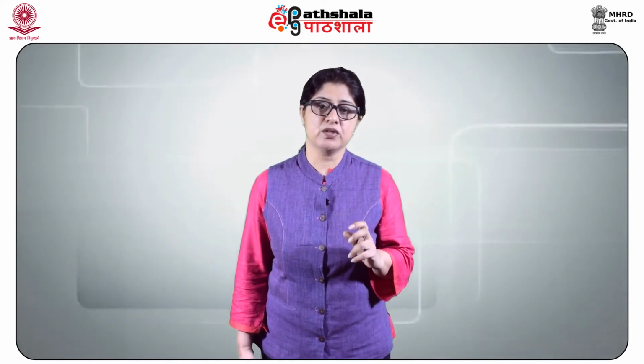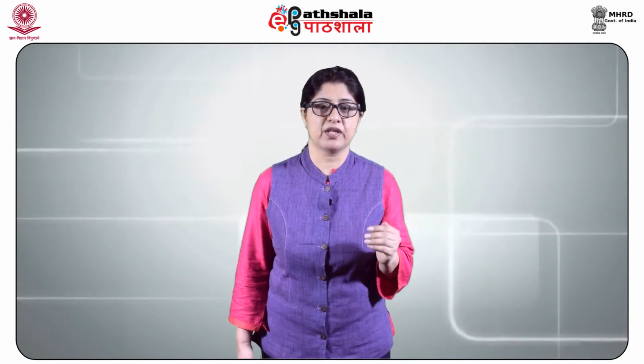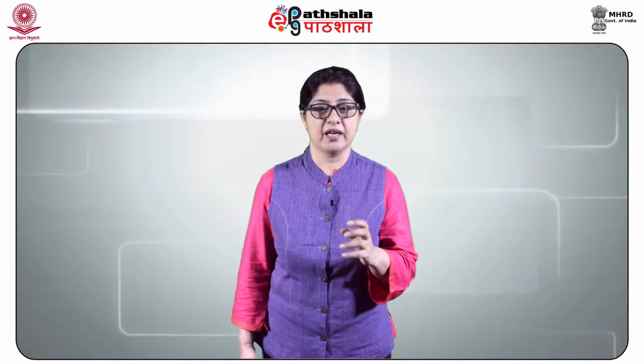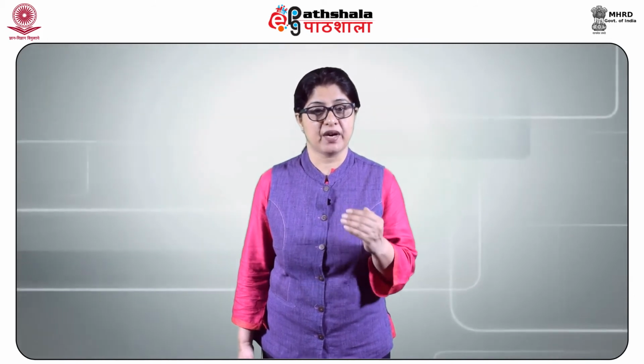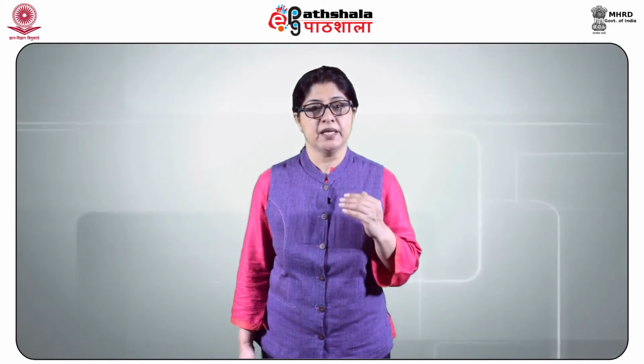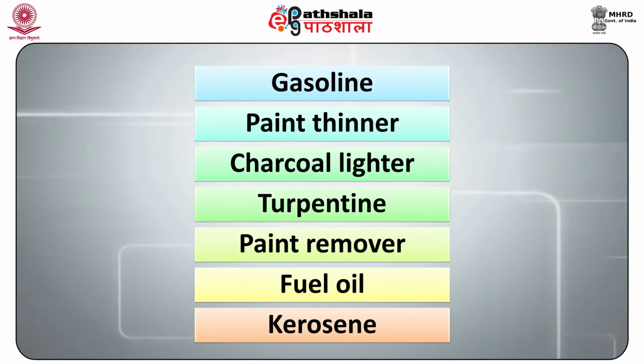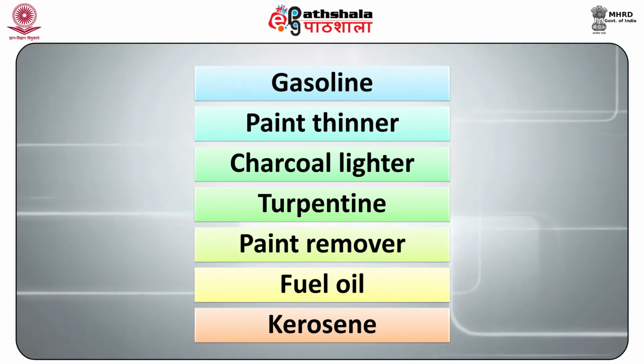Fortunately, evidence of their use is not completely destroyed, even for flammable material of high vapor pressure or when the environment has been elevated in temperature for several hours. Types of materials to be expected include gasoline, paint thinner, charcoal lighter, turpentine and many more.